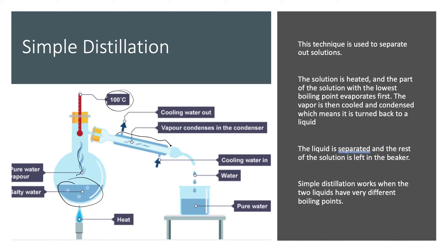At the sides of the condenser you can see cool water flowing through. This causes the vapour to condense in the condenser and turn back into liquid form. The water then comes out into the beaker at the end. By the end of this experiment we've got all the salt left in the original beaker and pure water collected separately.